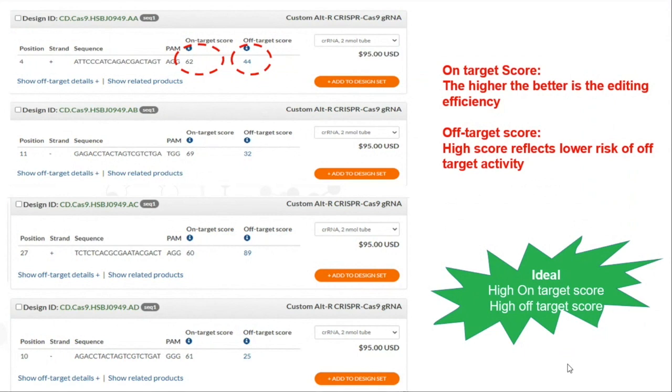Plus, what also matters is the quantity which you are ordering. Although I think yours is default and mine is also default here, if you're ordering a different quantity, the prices would be different. And as you can see, it is USD here. I hope you're also looking at USD and not any other currency, because on my side, when I was streaming from my browser, it was SGD, not USD. I hope that clarifies this doubt. He's saying understood. Great. Thank you, Suraj, that's a good observation.